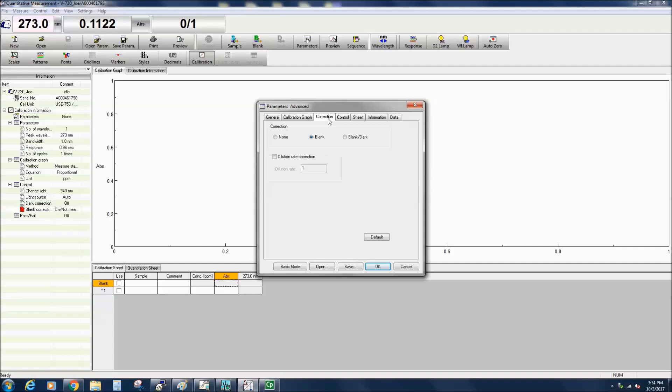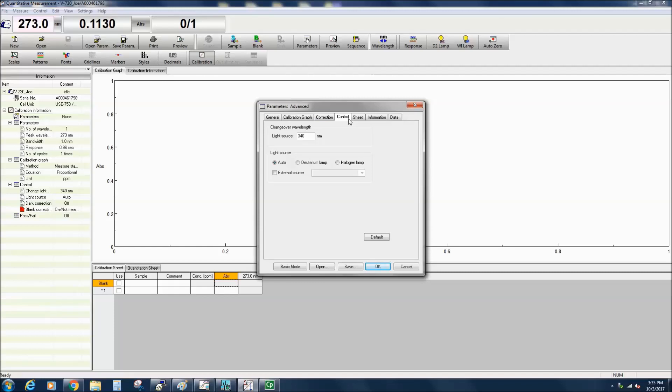In the Control tab, you can specify the changeover wavelength. The D2 and tungsten halogen lamps switch at 340 nanometers. If your peak absorbance is at 340 nanometers, you can move that changeover wavelength between 330 and 350 nanometers.